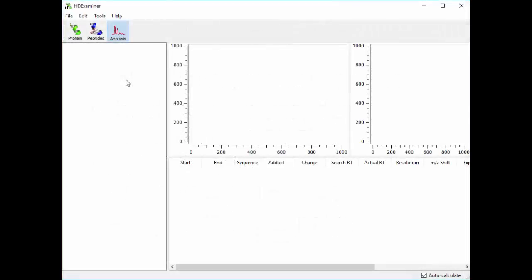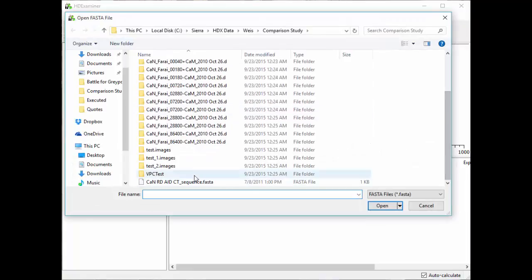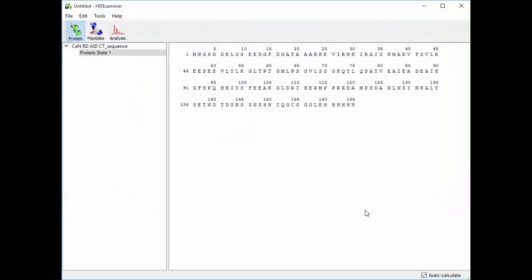So to begin using HDExaminer, we go to File, New, and we bring in a FASTA file of our protein. So I have one here, I open it up, and there's our protein sequence in the HDExaminer window.